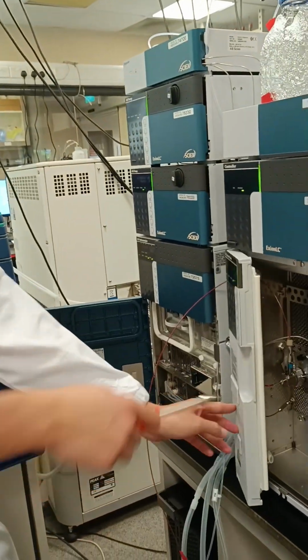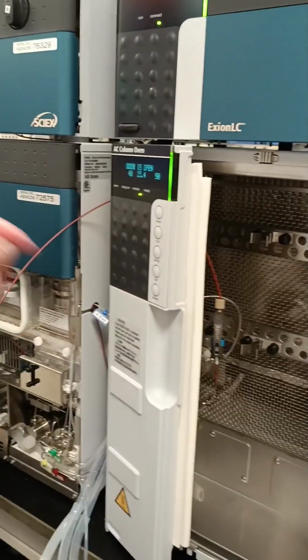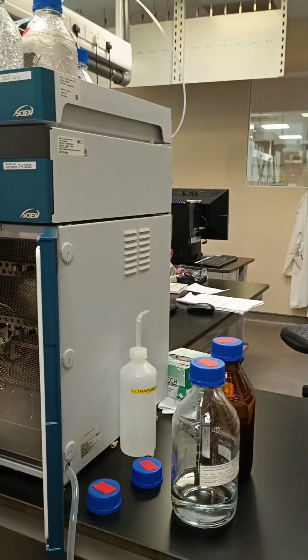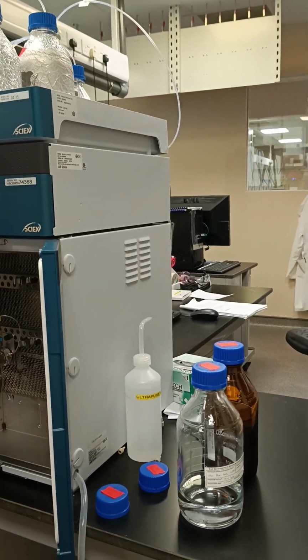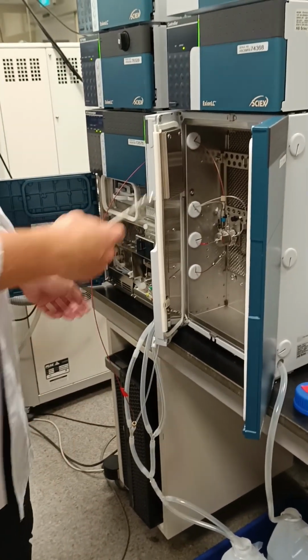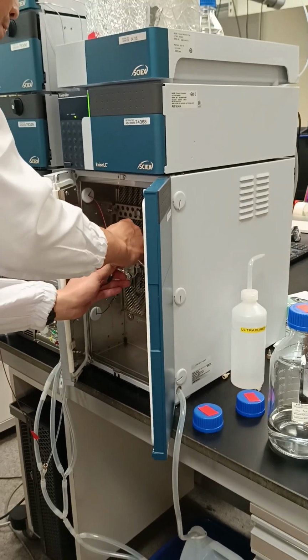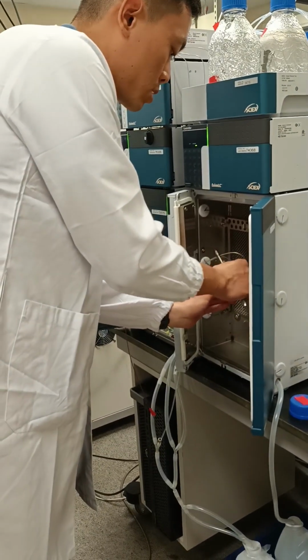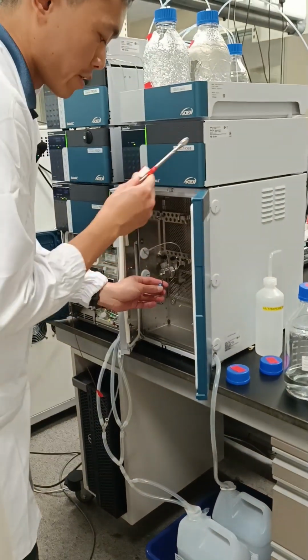I'm not sure we can see, there's a red line here. This is from connecting the autosampler, and this is where you install your column. So the direction will be here to here, then goes up, then through here. Eventually this will connect to the MS machine. So make sure you know the direction of the flow so that you can install the column properly. The next thing is we just install this column. The direction will be going up.